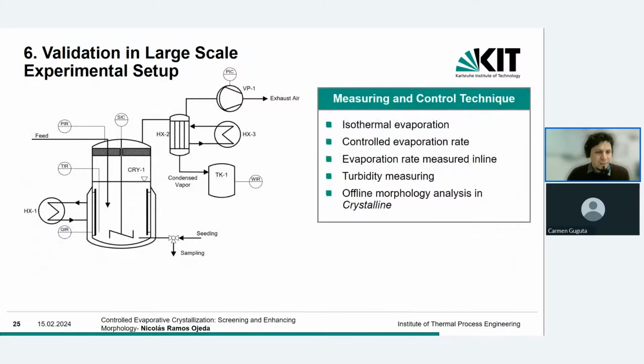The liter scale experimental setup is a stirred crystallizer with a double wall glass. The system pressure and boiling temperature were regulated by the vacuum pump integrated controller.